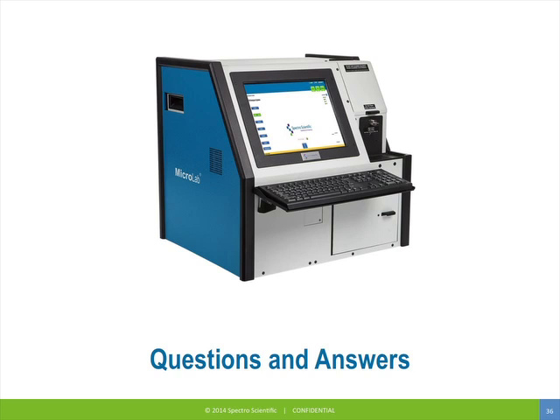I think we have a question here coming from an oil supplier and service provider, and this is a question about LubeTrack and data management. Can I be granted LubeTrack access from a remote point on behalf of my client? Yeah, that's actually a great question because it shows the flexibility that LubeTrack has.